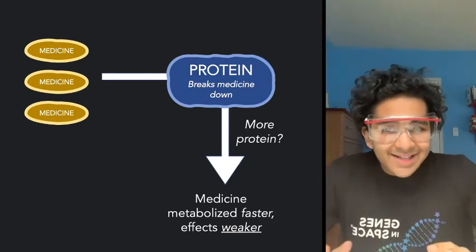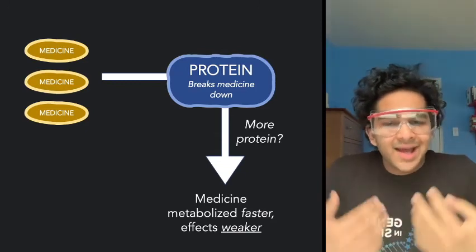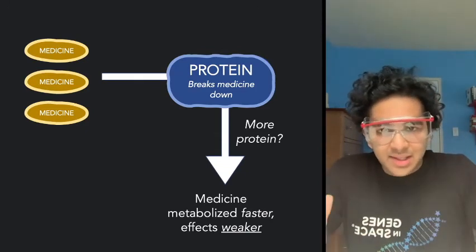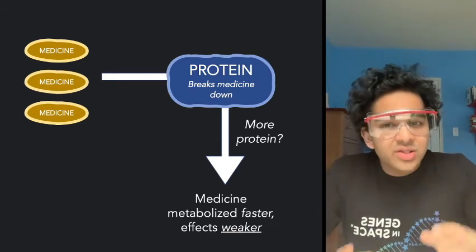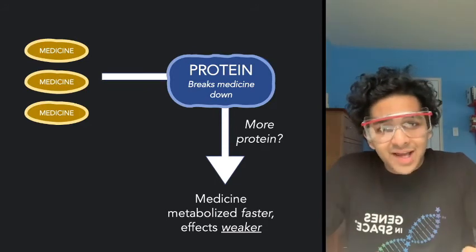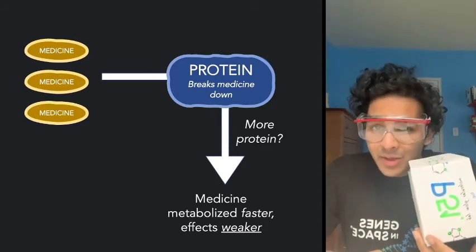So next, I'm going to isolate RNA from the cells, reverse transcribe it into cDNA, and design a PCR reaction for some gene of interest. Let's call it gene X. And this is going to be the gene that encodes the drug metabolizing proteins we talked about earlier. And while we're here, let's not forget that we also have to add DNA binding dye. That's going to help fluoresce in the P51.